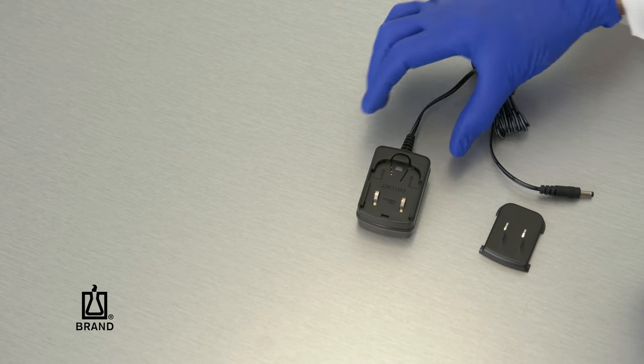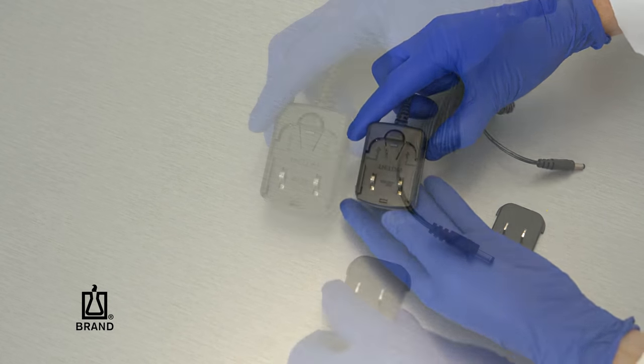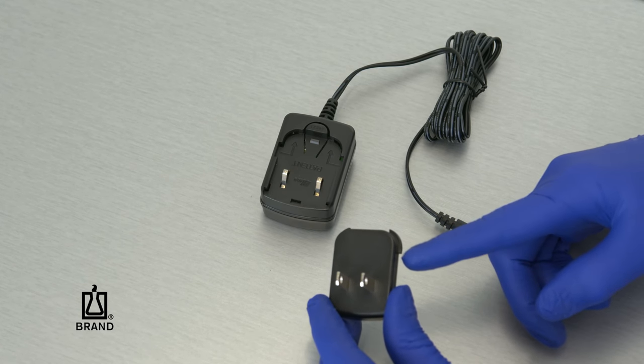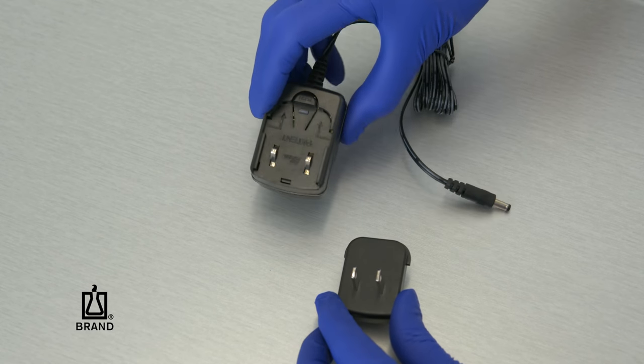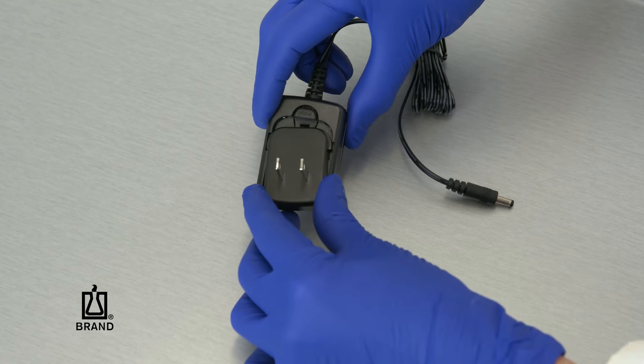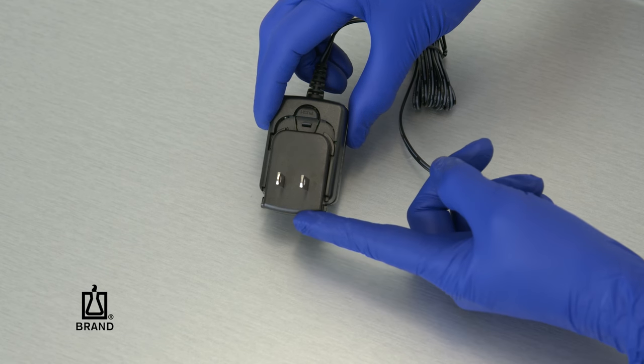To assemble the power cord, select the appropriate adapter for your region. Align the rounded portion of the plug adapter to the arrows on the power adapter and slide until it snaps into place.